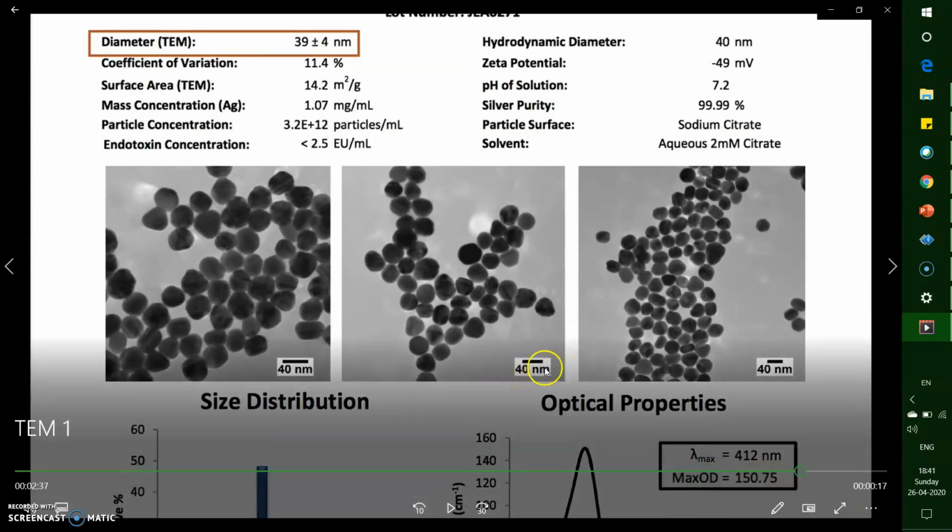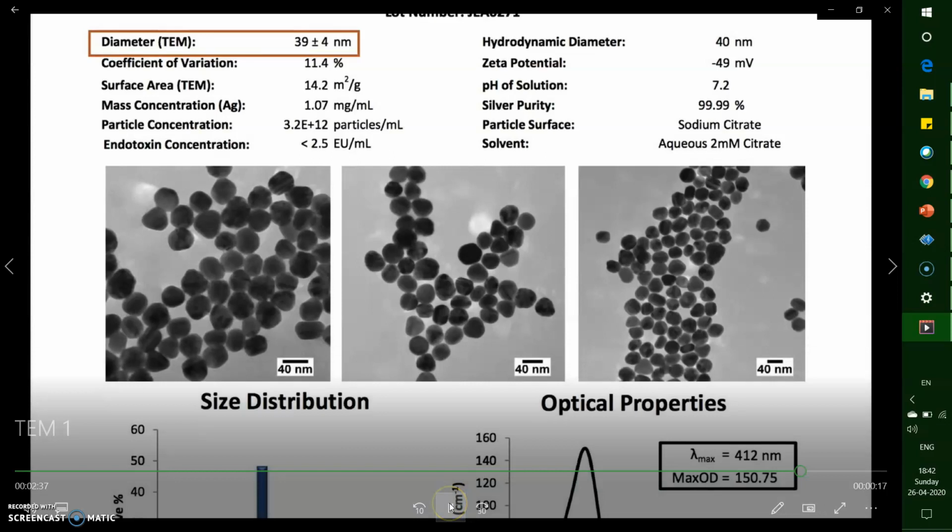Here they can set the resolution; the scale is 40 nanometers. So 40 nanometers means in this space, you can move this scale to this place. If it occupies a particular place, that is 40 nanometers in size. Likewise, we have to calculate the size of the image.